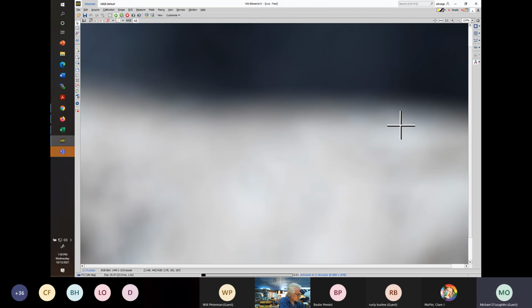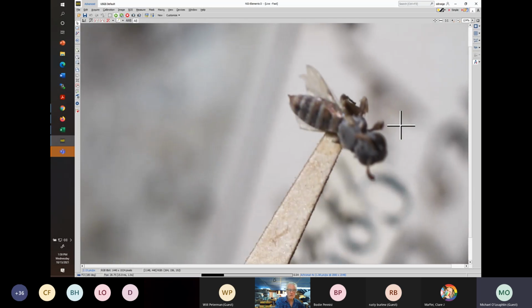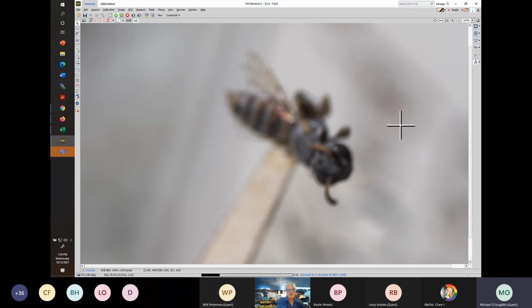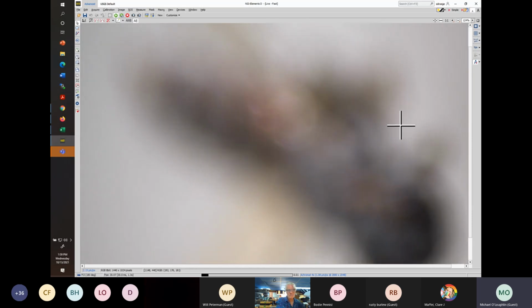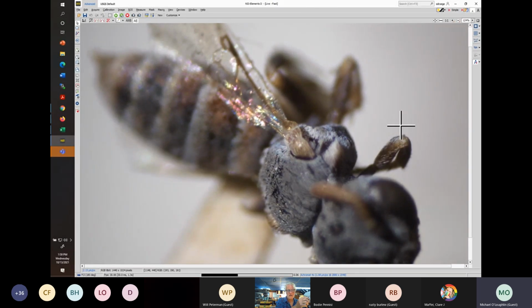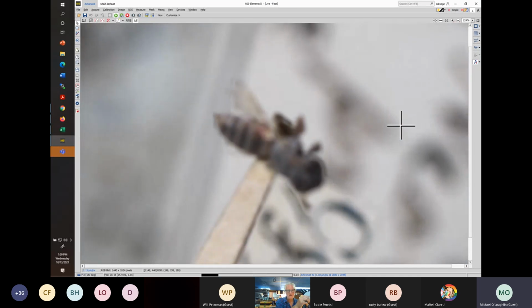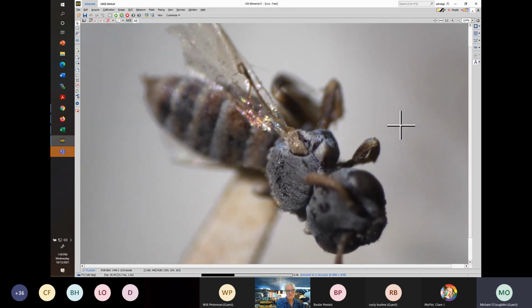oops, these are old and stuck inside their mocks. I don't want to bust them off. They don't have those patterns like Holcopasites does, but they look dusty a lot of times. So like this one here, because they're covered with a dust of appressed hairs. But you can see if we back off, it's on a point, and it's just super tiny. That might be 2 millimeters in size.